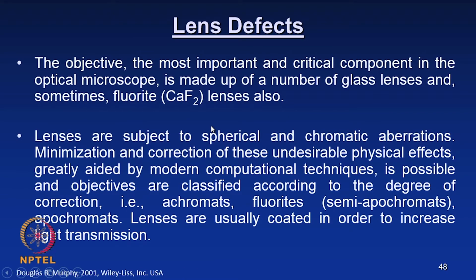So we will now summarize these lens defects, and we will see how they are characterized or corrected based upon the different degrees of correction.